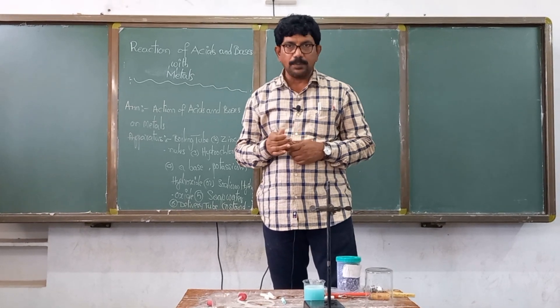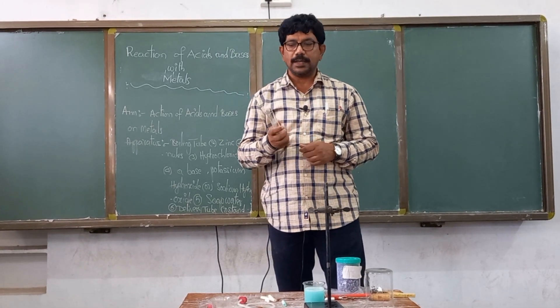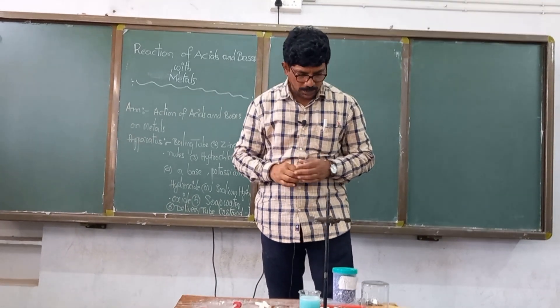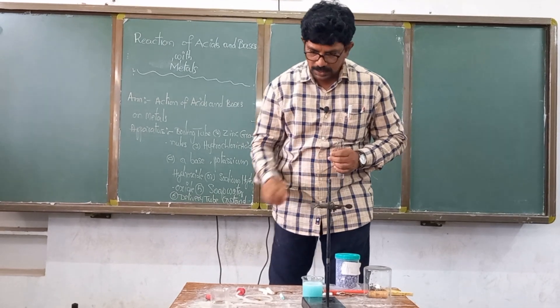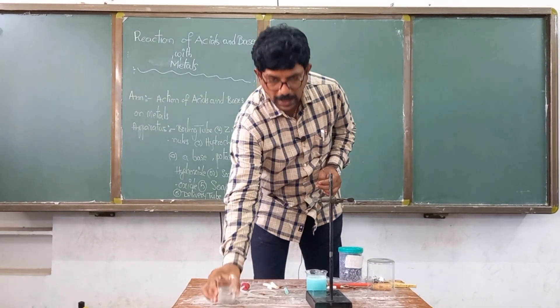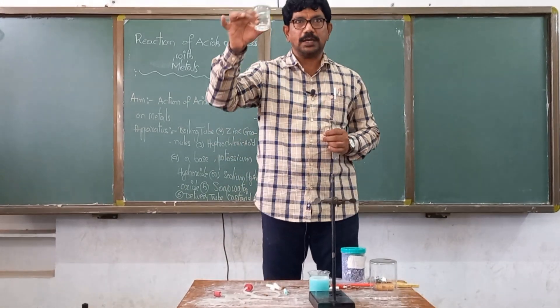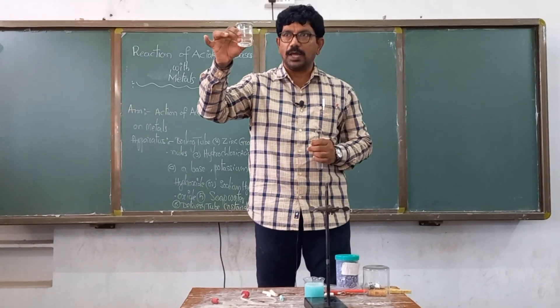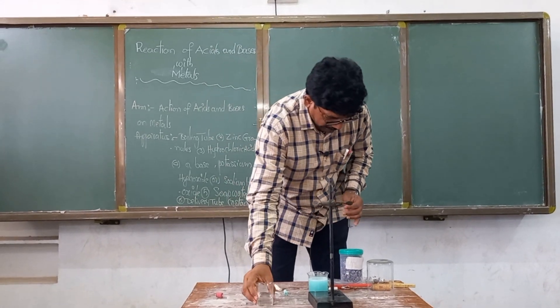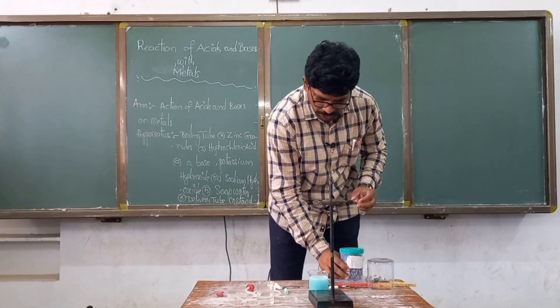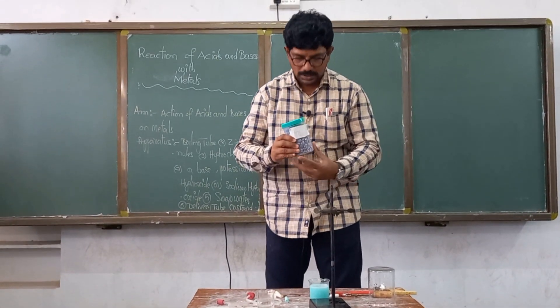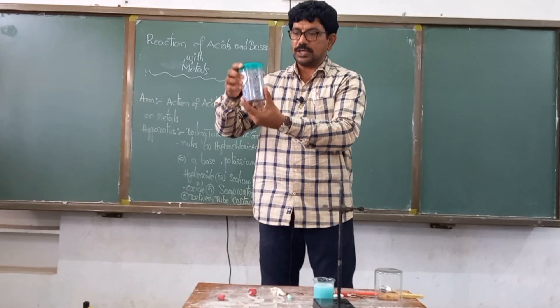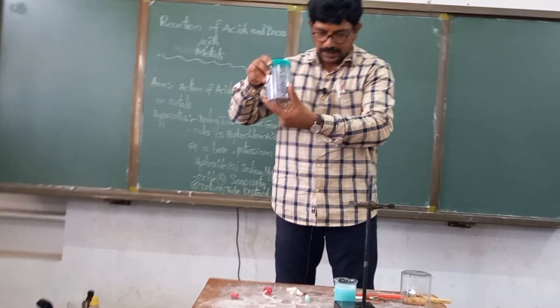For that, what are the materials needed? A boiling tube. Next, dilute hydrochloric acid or sulfuric acid — dilute hydrochloric acid. Next, zinc granules. These are the zinc granules.